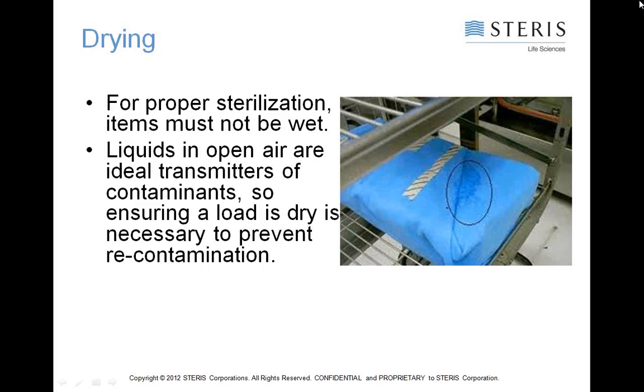A pure gravity cycle will incorporate no vacuum. You can incorporate vacuums into a gravity cycle and a purge, or maybe some drying time. But basically, you are putting steam into the chamber and pushing the air down the drain. And it is perfectly effective for sterilizing most things, but especially metal components, glassware, non-porous items that don't trap air. Gravity cycle is very sufficient.